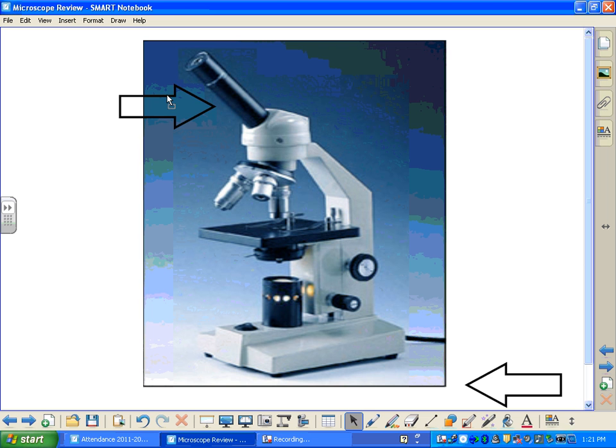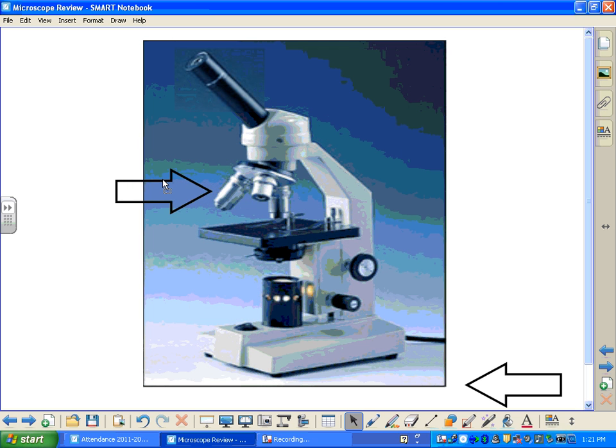Below that is the body tube that connects the eyepiece to the rest of the microscope. Looking at the left side of this picture, we've got three lenses coming off of our microscope — a small, a medium, and a large. The small has the low power lens in it, the medium has the medium power lens in it, and the long one has the high power lens in it. Keep in mind the eyepiece also has a lens in it.